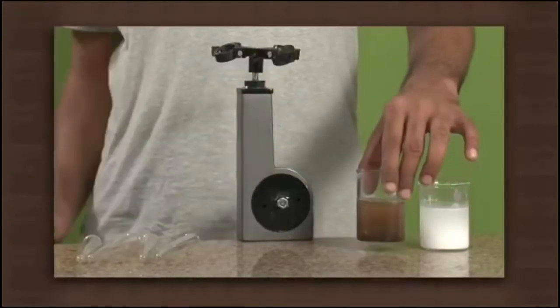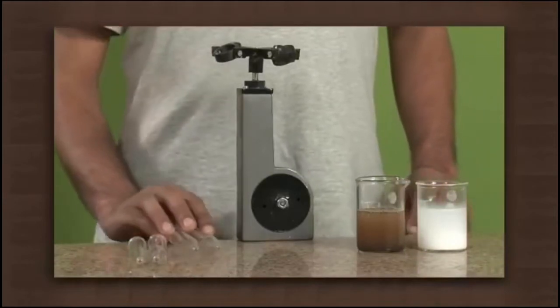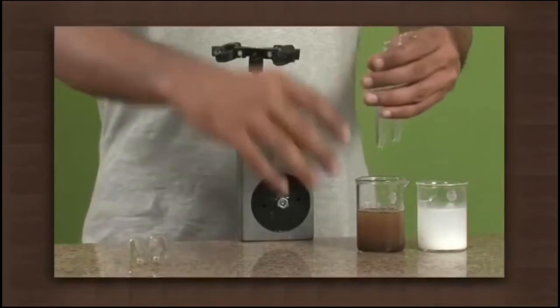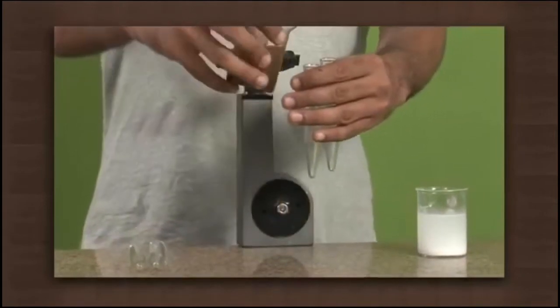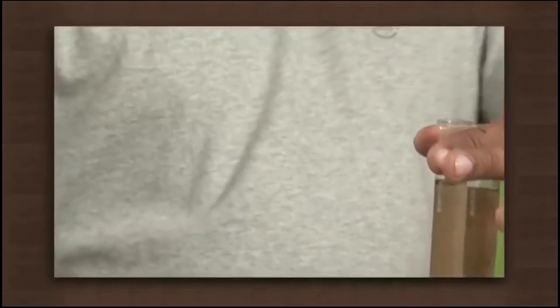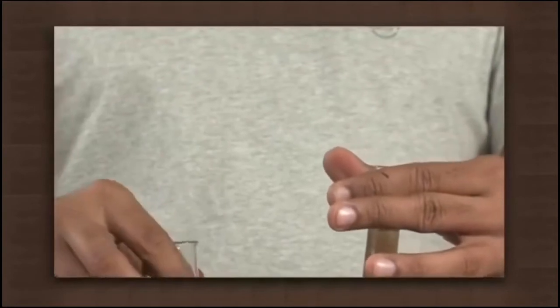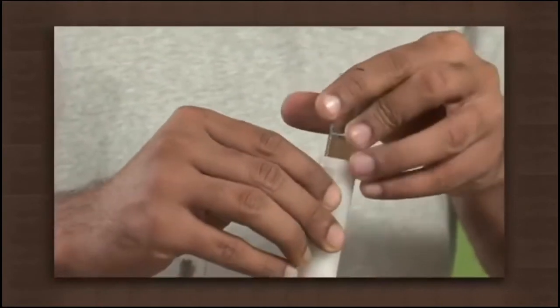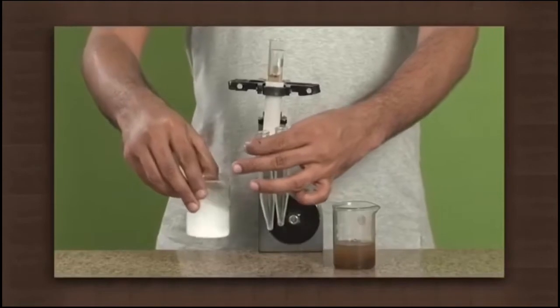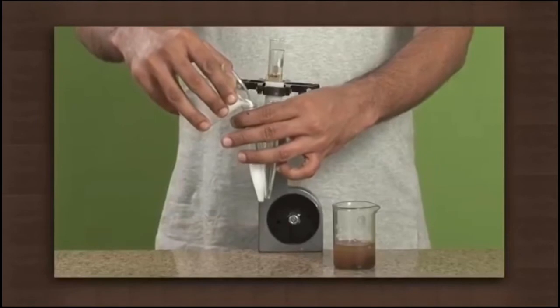Let us conduct an experiment to see centrifugation. For this, we need a handy centrifuge machine, muddy water, a mixture of calcium carbonate in water, and 4 centrifuge test tubes. First thing to do is take the sample of muddy water and place the test tubes in the centrifuge machine. And now take the calcium carbonate mixture in the test tubes and also place them in the centrifuge machine.